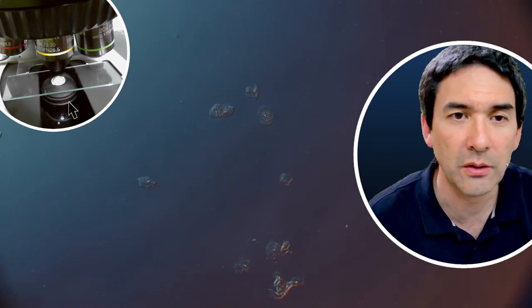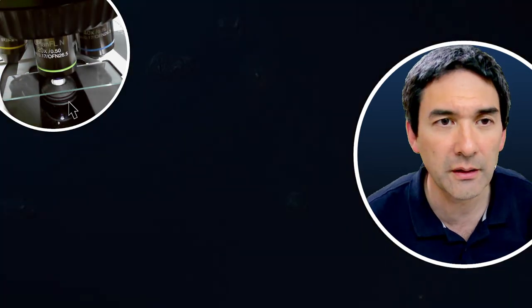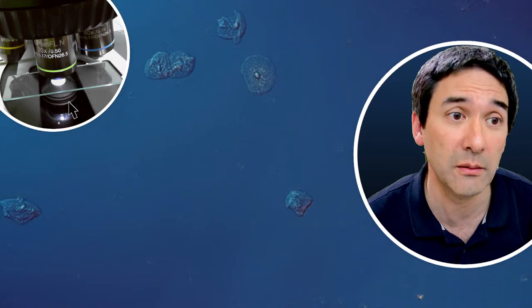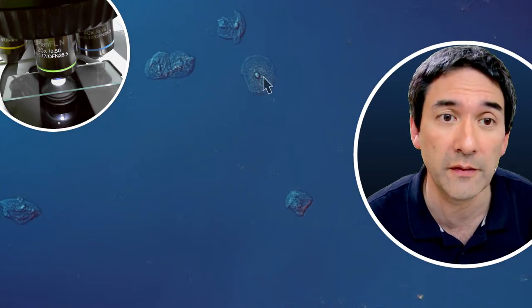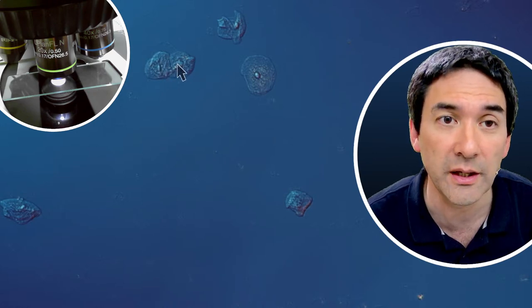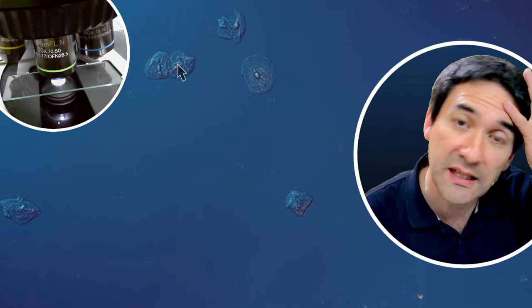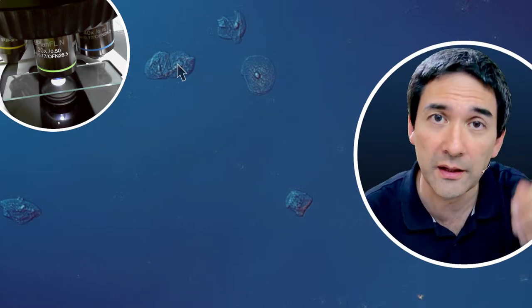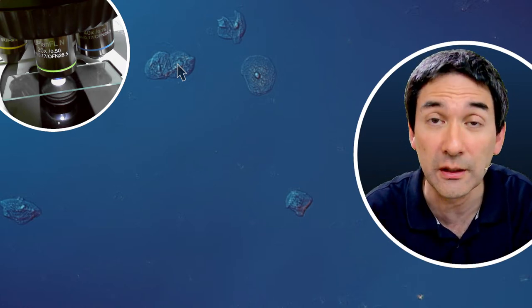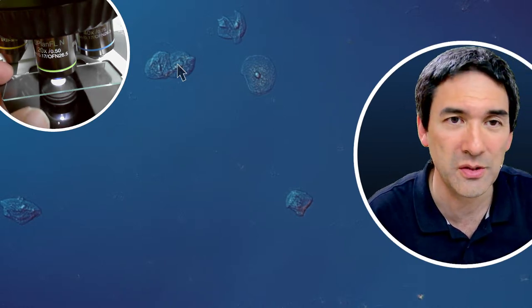Okay, so these are all my cheek cells from my mouth, in DIC. You've seen them already before if you know my live stream. The cheek cell in the center here, you've got the nuclei, two of them sticking together, clustered together. If you want to collect skin cells from your body, I think it's much easier to use sticky tape. But then the problem with the cellophane tape is that it's also polarizing, so it might not always work well.